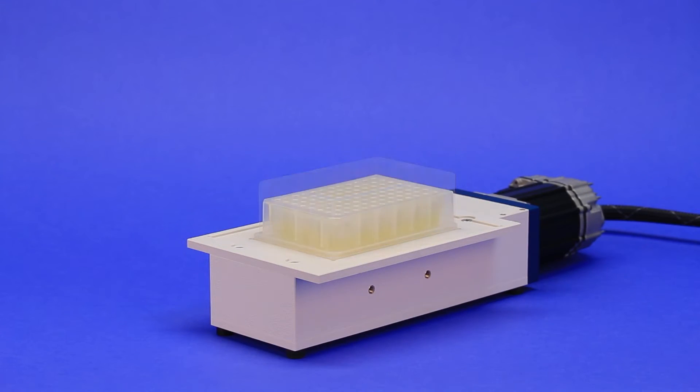Microplates are another type of labware you can mix with our tumble stirrer. You can use any format, any plate type, or any volume.